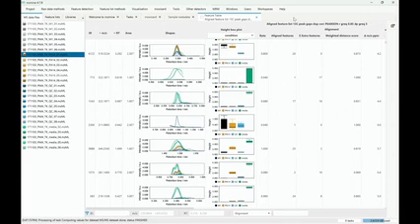And then also the mass accuracy would be really bad because they would just use a different algorithm that you don't want to use. And there's also a warning if there's empty scans, because we think that at least the MS1 should not be empty. Sometimes, honestly, some of the first scans are empty for whatever reason. But then we give you a warning like, hey, there's empty scans. Maybe someone already filtered your data too much. So make sure to use the raw data, drag and drop it into mzmine, and if you get the exclamation mark and you did everything in a good way, just ignore it. It's only information. All right, thank you.